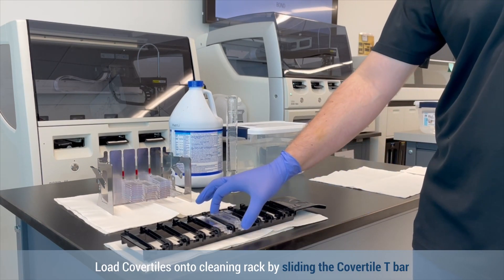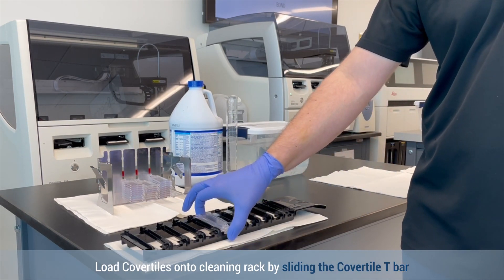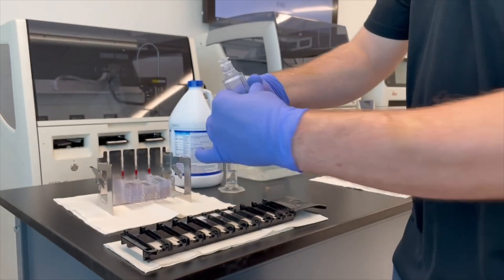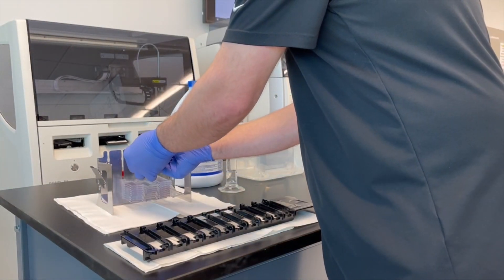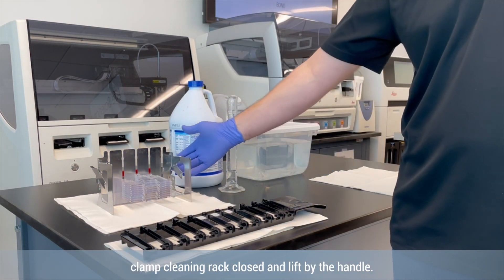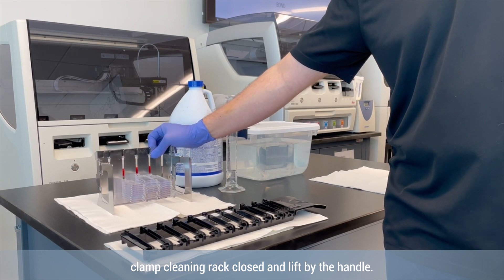Load cover tiles onto the cleaning rack by sliding the cover tile t-bar along the rail of the cover tile cleaning rack. Once cover tiles are loaded and you are ready to clean, clamp the cleaning rack closed and lift by the handle.